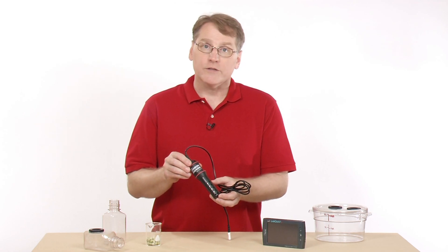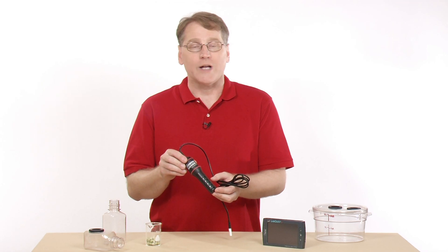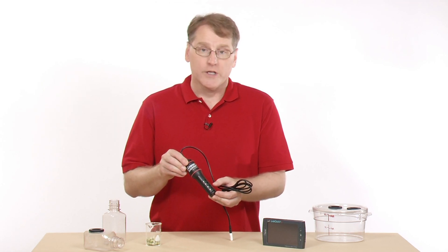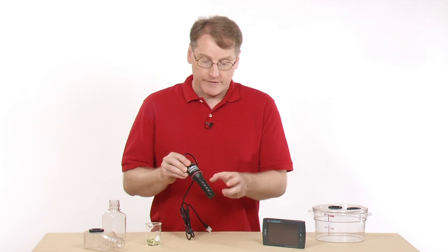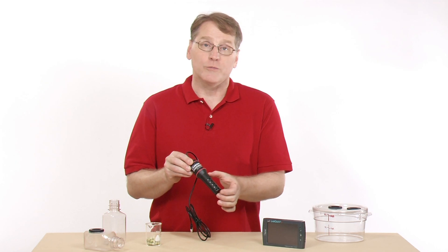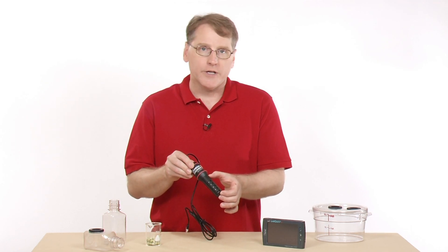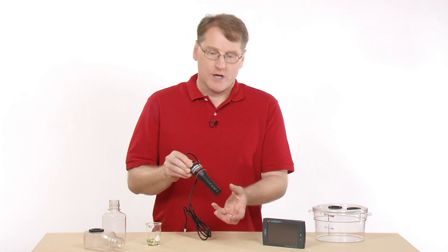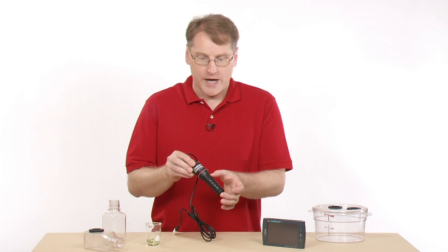The way this sensor operates, it uses an IR detector. It has an infrared source, and if CO2 goes through these holes, the CO2 will absorb some of the infrared radiation. The higher the concentration of CO2 gas, the less infrared makes it to the detector.